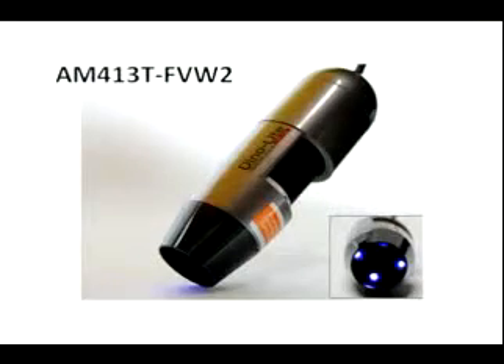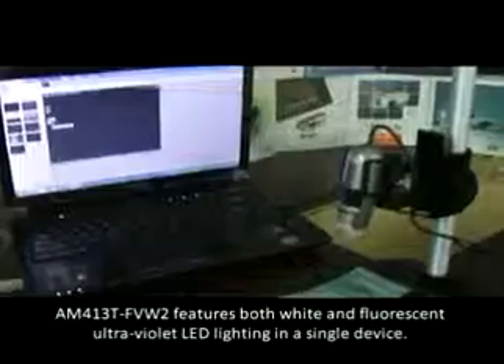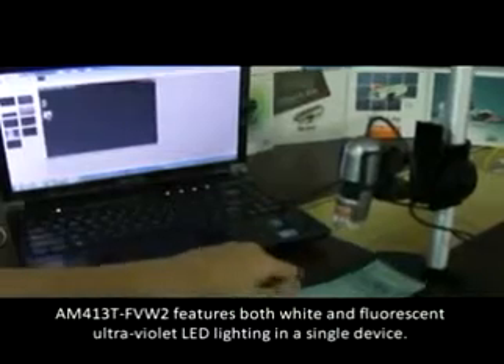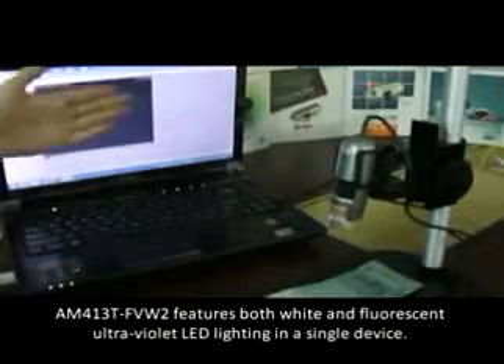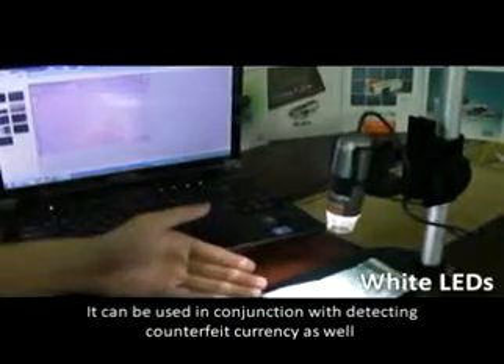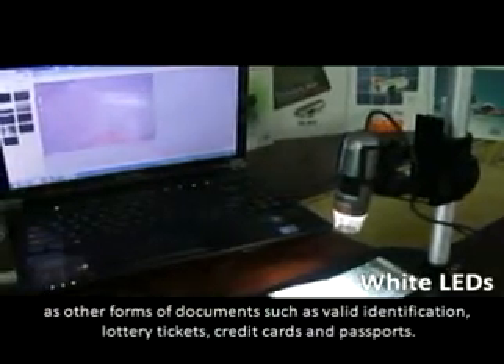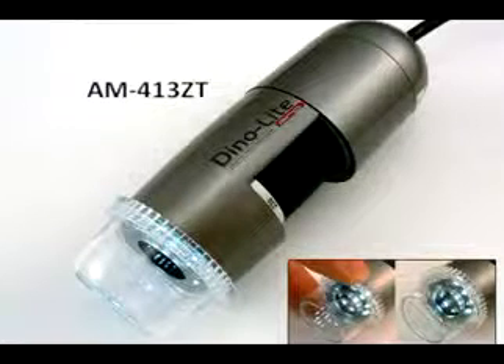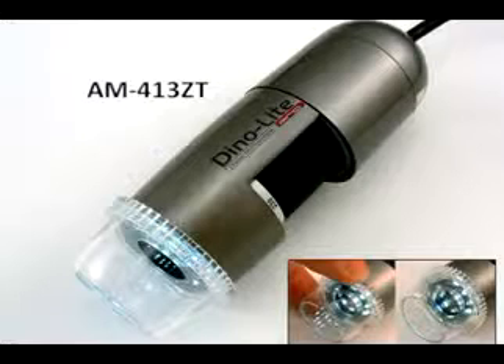The AM413T-FVW2 has two types of LED lights that are switchable between white and UV light. It features both white and fluorescent ultraviolet LED lighting in a single device. It can be used for detecting counterfeit currency, as well as other forms of documents such as valid identification, lottery tickets, credit cards, and passports.